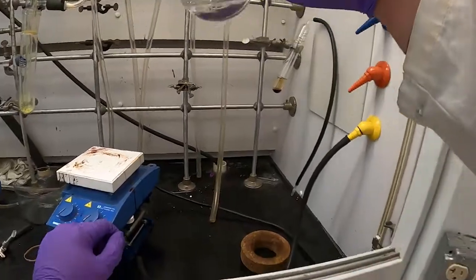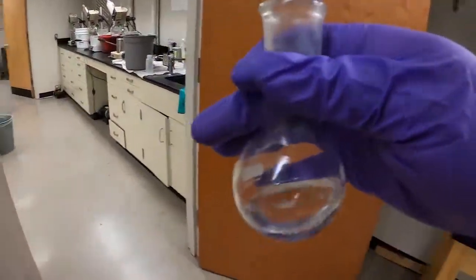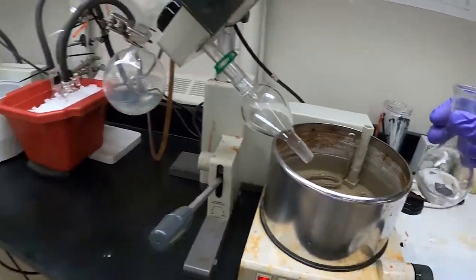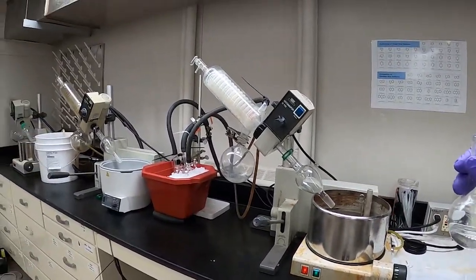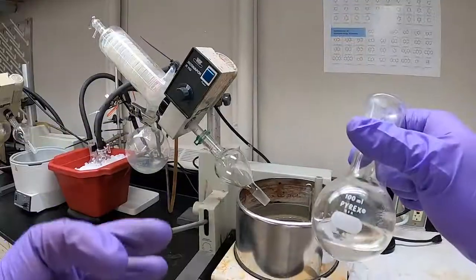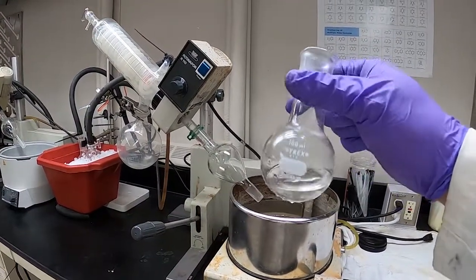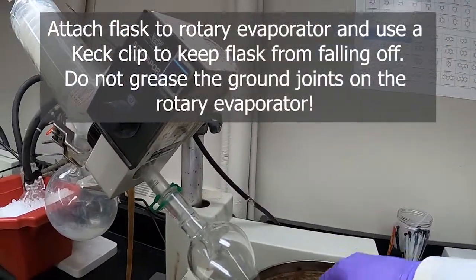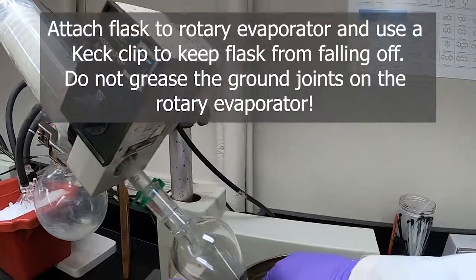So here's our solution. Take it over to the rotovap here. So that's one of these devices. We have 3 here in the lab. I'm going to use this one since it's connected to just one pump. So I've got our flask of solution here after pulling it out from the filter. And I'm going to attach it here to the rotovap.